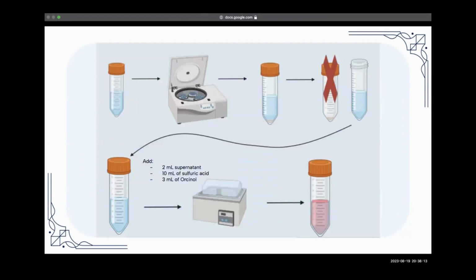This is a diagram that covers the whole experimental procedure. The starting tube on the top left is one of our 10 samples of xyloglucan and CNC. Each sample is left overnight in a homogenizer. Then 5 ml of sodium chloride is added. The sodium chloride will make the CNC unstable and help precipitate it in our next step, which is centrifuging it.